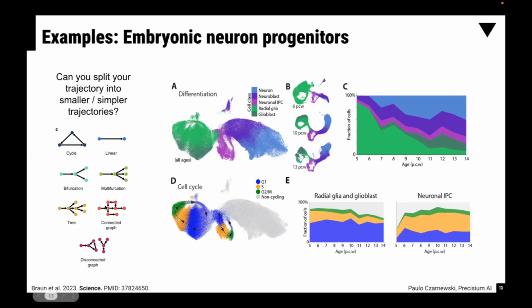So you have a progenitor cell, and then the stem cells keep this cycling loop to generate more and more progenitor cells. And some of those will then exit that cell cycle phase and start the differentiation and final maturation into mature neurons. And those later will remain in your body for the rest of your life. So for trying to study this whole process, maybe a connected graph would be a better suited alternative here.